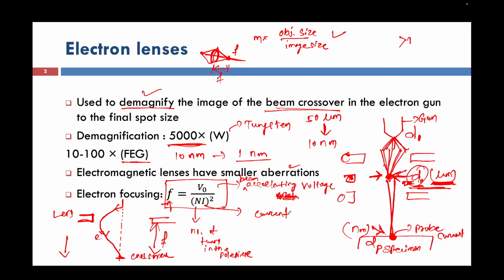So here we can see that, let's say we have made an SEM and we don't want to disturb the focal length of our electromagnetic lens. We want to make this F value stay as it is, but there will be samples which require a little bit higher accelerating voltage to see the features, and there will be samples which need lower accelerating voltage to see their features.